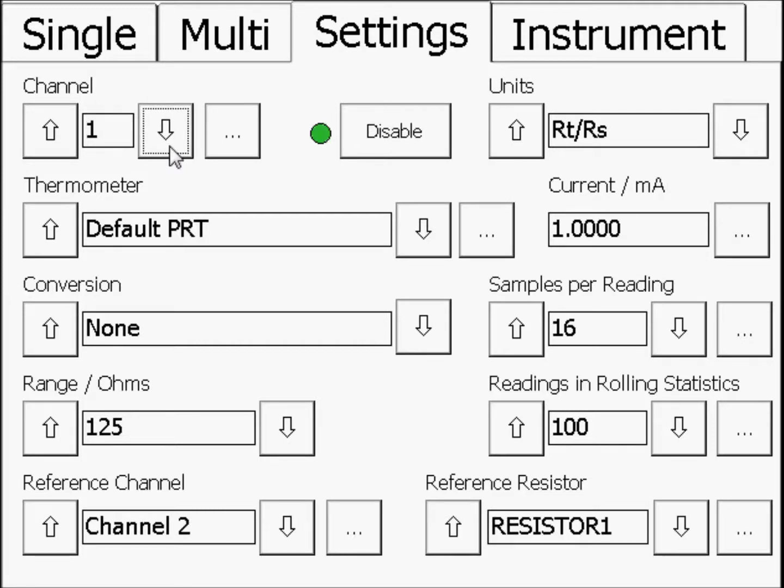Thermometer: Default PRT. Conversion: None. Range: 125. Reference Channel: Channel 2. Units: RT over RS. Current: the measuring current your SPRT is used at.